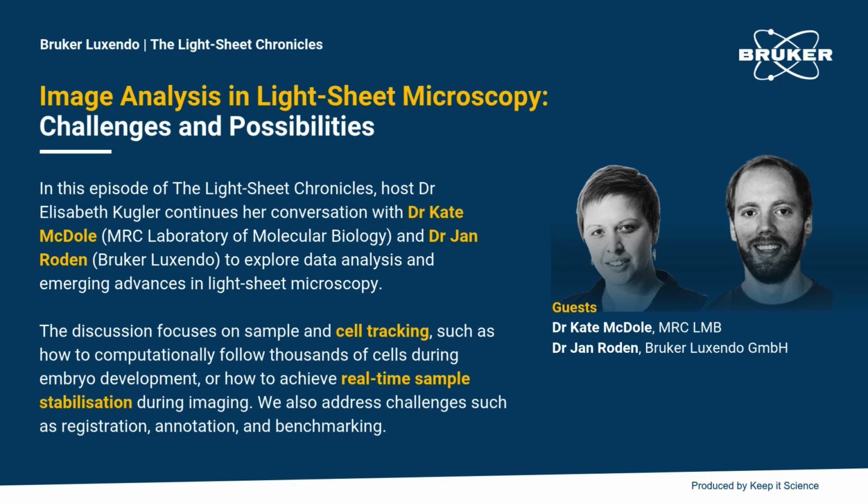At what point do you decide to delete that data? We're very judicious, I want to say, in how we store our data. So we take the Marie Kondo approach, which is you look at your data, and if it does not spark joy, if something happened with that data set, if something happened with that embryo, or you have a better one, you just delete it. If it's not perfect, you just delete it.